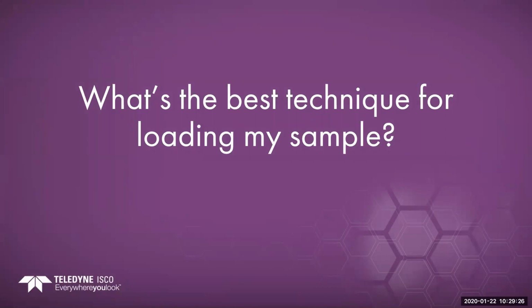So we've discussed the choices we have when doing method development for our prep separations. The next component I really want to focus on is sample prep and injection techniques for Prep HPLC, because there are a lot of choices that affect our chromatography, and we can make gains by making positive choices here.